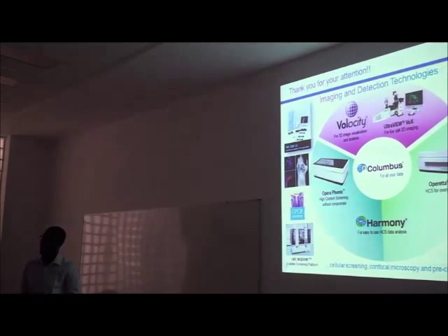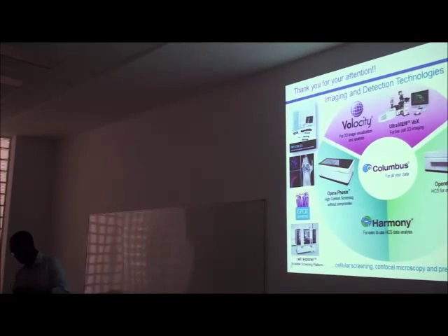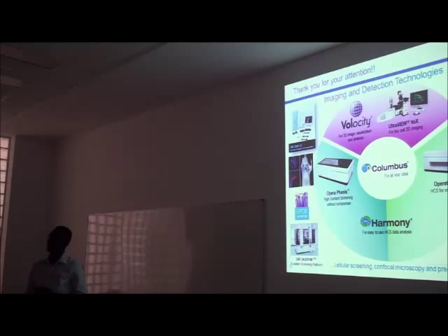There is a recent trend in drug screening: people try to switch to 3D cultures, like human spheroid cultures, instead of 2D cultures, because they are more realistic models of tumor, right? Yeah. So I was hoping that you would present some applications, because there are applications of some Operetta human spheroid.